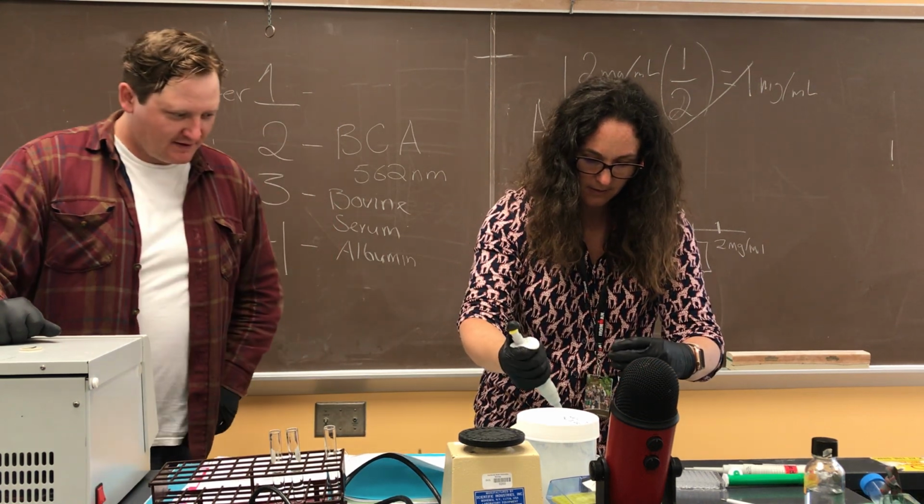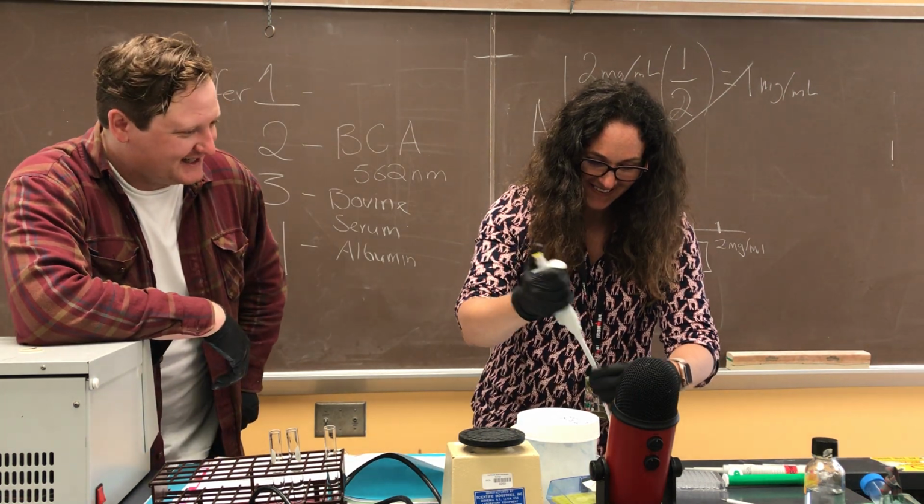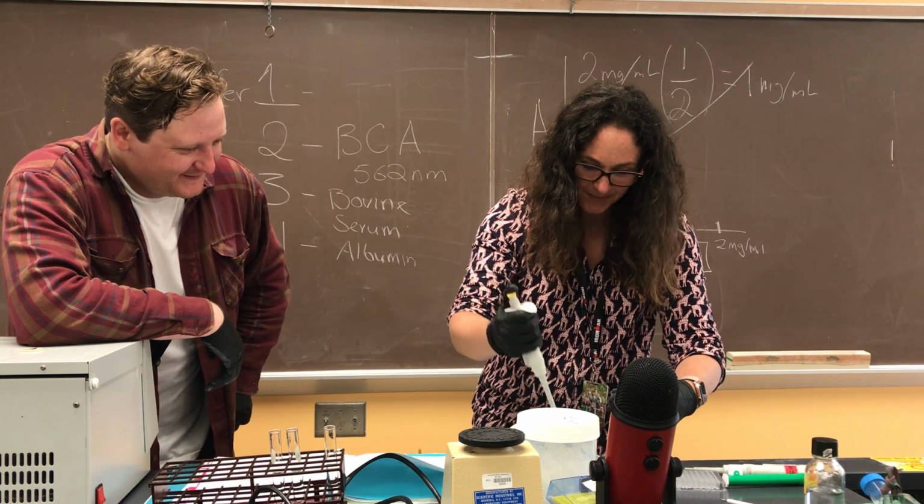Okay. This is what bench work usually looks like. Too many cooks in the kitchen. All right, so I'm just adding the 100 to each of them.